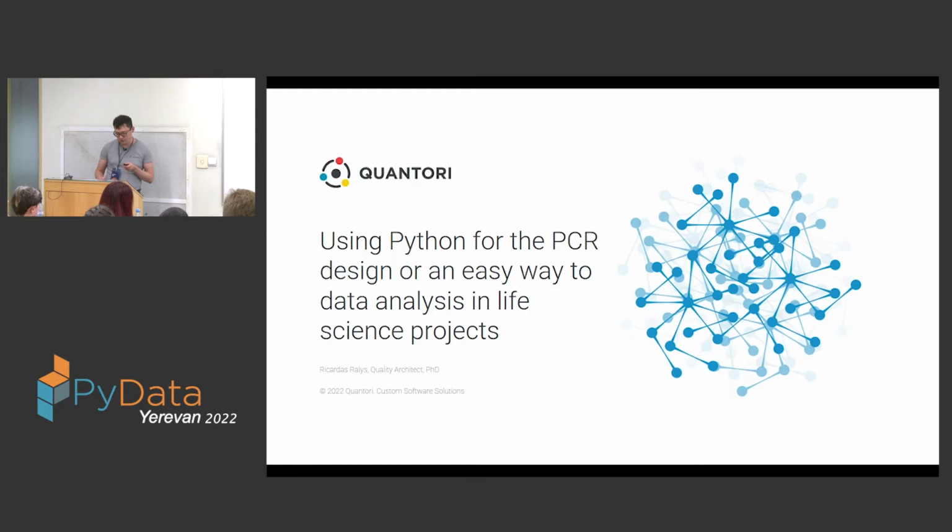In my presentation, I would like to talk about how I'm using Python and its features to allow for efficient PCR design and solve one of the hardest problems which we encounter during that problem solution.